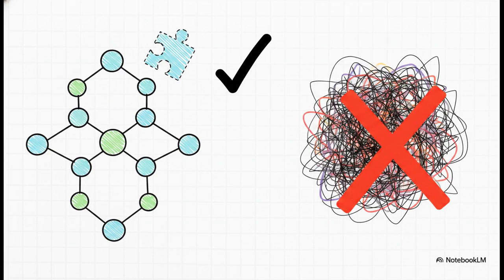But hold on, we need to be absolutely sure we found the real molecular ion and not just random background noise. It has to follow strict chemical rules. You see, the highest mass isn't always the molecular ion by default. Highly branched molecules can fall apart so easily that their molecular ion vanishes completely. We also have to make sure we aren't measuring background contaminants. And crucially, the distance between the molecular ion and the smaller fragments has to make mathematical sense. Like, if you see a loss of 18 mass units, that perfectly aligns with losing a water molecule.